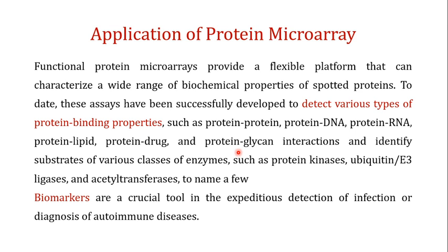And you can also identify the substrates of various classes of enzymes, such as the protein kinases, the ubiquitin E3 ligases, and the acetyltransferases. So these are some of the major applications of the protein microarray that have been achieved so far.